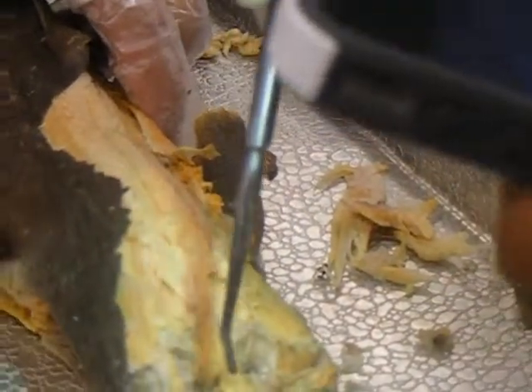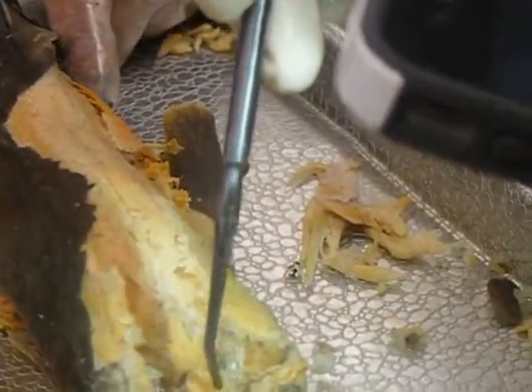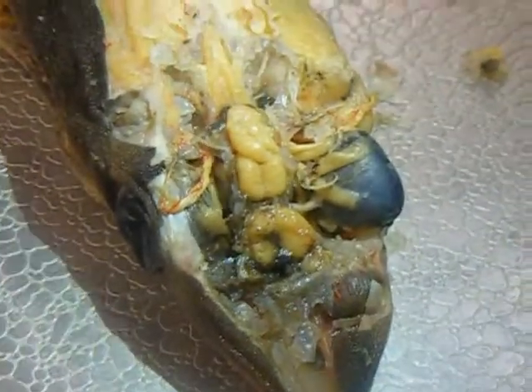That's the cerebellum. You have the anterior part, closer to the front, and then you have the posterior lobe, closer to the back.